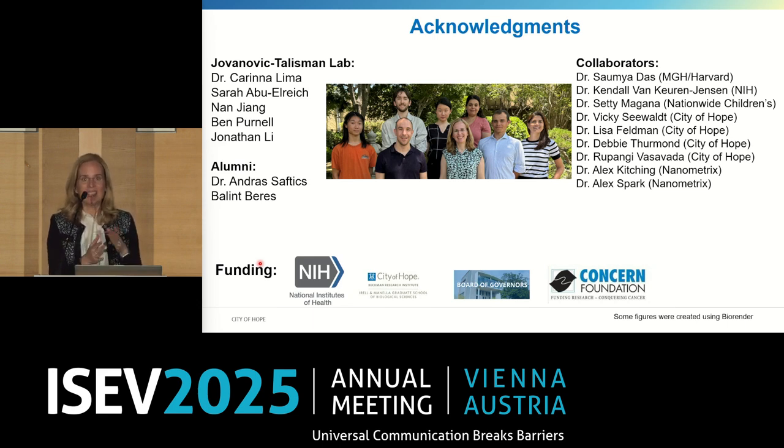So it's not one size fits all, because we all have different samples, and each of us has to consider different points. Do I need to purify EVs, or isolate EVs, or not? That's another thing. Thank you so much.